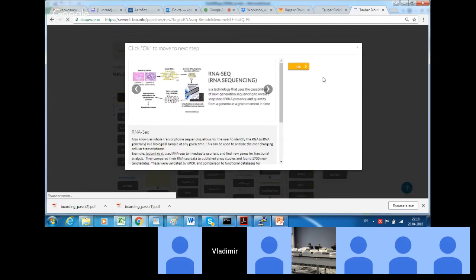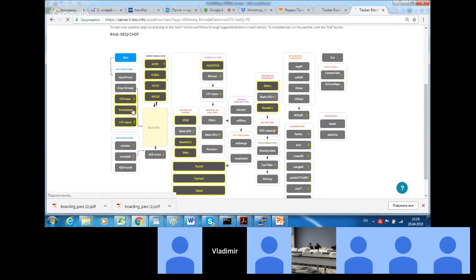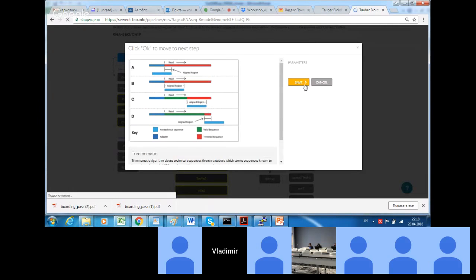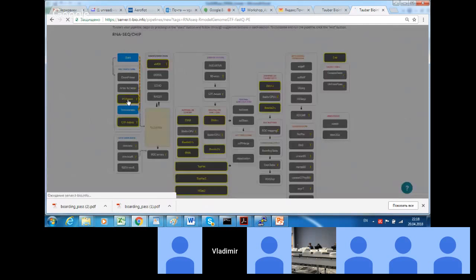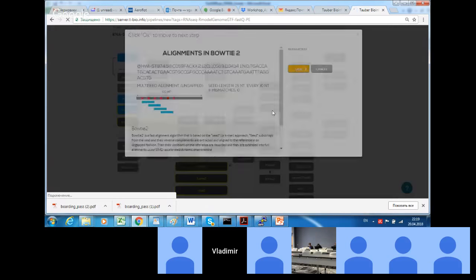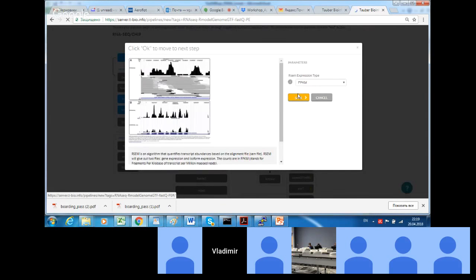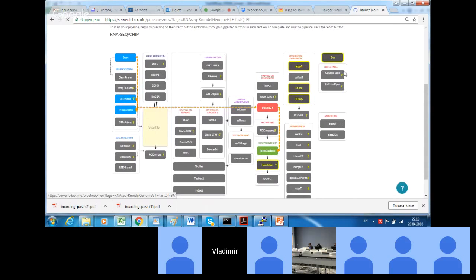And as we again start with raw files, initially we can perform the same quantification of expression levels. I just recreate the pipeline we initially created. But at the last step, we add a module for differential expression analysis.